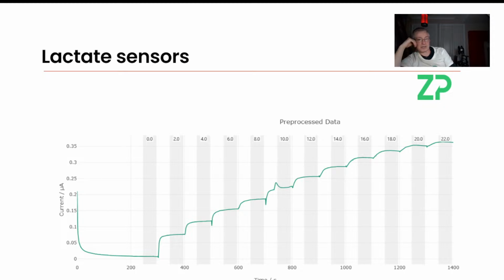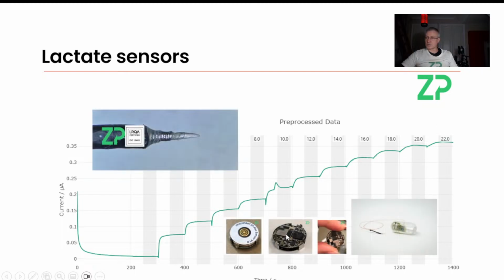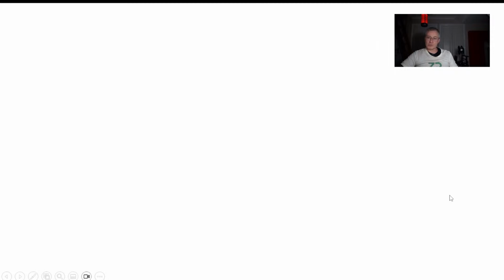The enzyme's becoming limited. If that term Michaelis-Menten's not super familiar to you, just Google it. Maybe I'll put a link. No, I'll probably forget to do it, but there's a video on our webpage I put up in November 2024 that you should be able to find on Michaelis-Menten. I just put this as a sidebar note that we've actually been making these sensors and they work really well. And that's a little peek preview of a wearable potentiostat that's also coming out in probably Q1 2025.